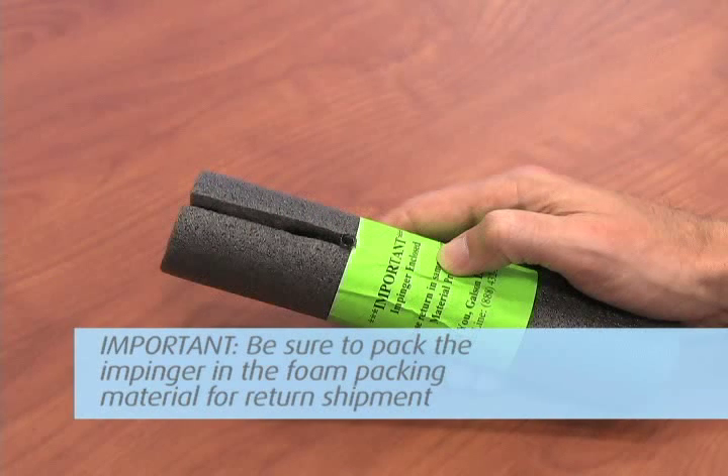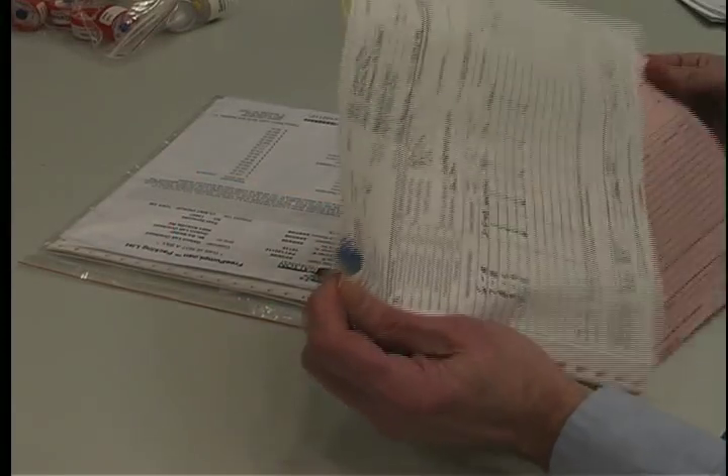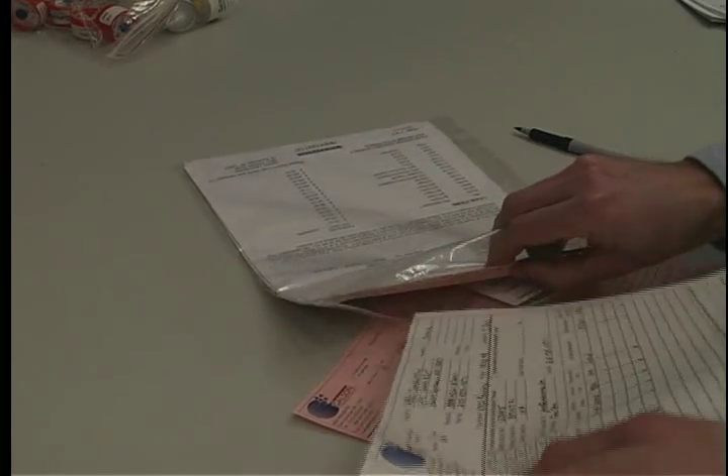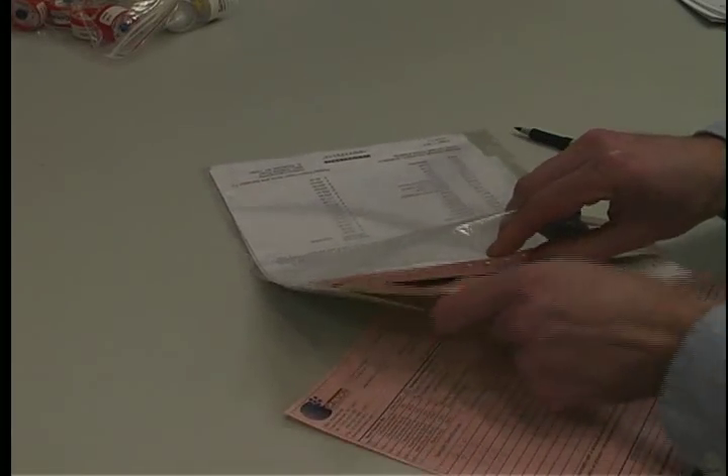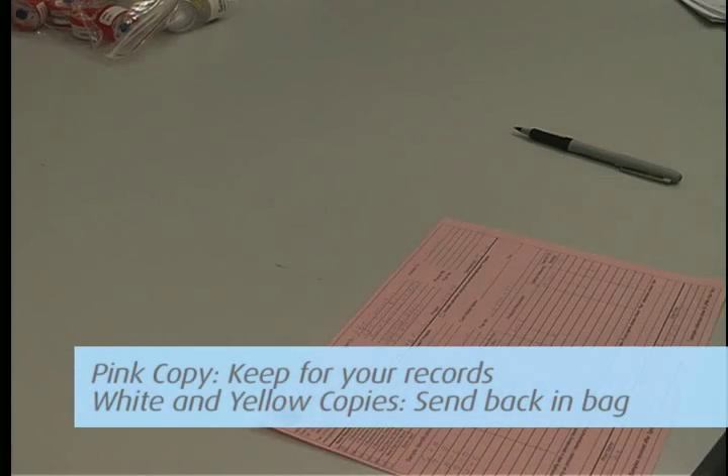Important! Be sure to pack the impinger in the foam packing material for return shipment. Then complete the chain of custody form. It is important that you include all the information requested in order to ensure the turnaround time of your samples. Remove the pink copy and keep this for your records. Send the white and yellow copies in with the samples to the lab in the large Ziploc bag.